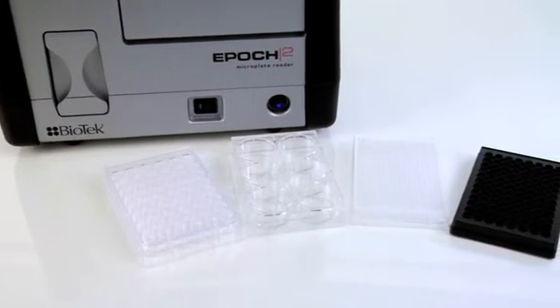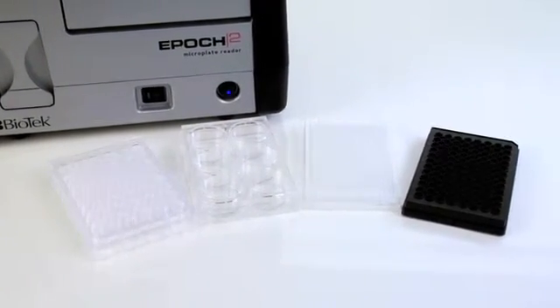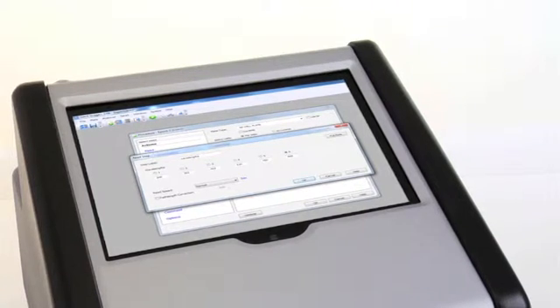EPOCH2 provides fast UV-Vis measurements in 6 to 384 well microplates with its 200 to 999 nanometer wavelength range.